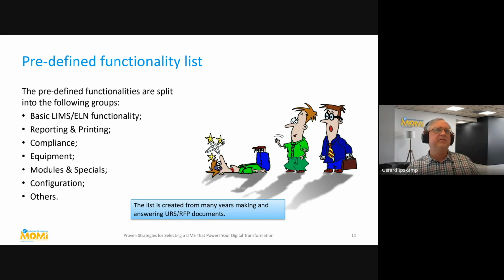So: basic functionalities, LIMS and ELN. Sometimes that's a gray area. What is ELN? What is LIMS? So that's why I sometimes put them on one list. Reporting and printing, compliance, equipment and equipment management and connections, and these types of things.